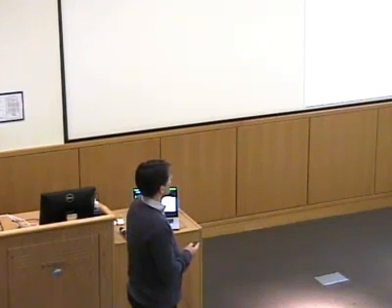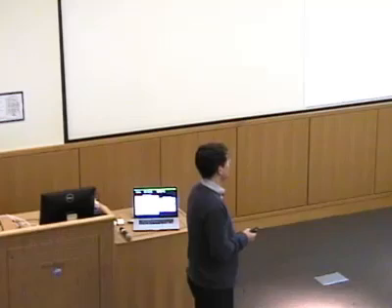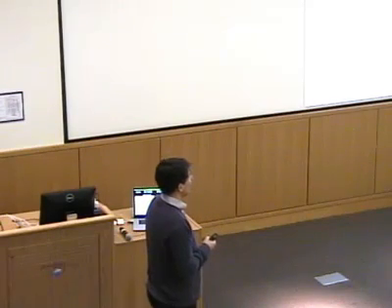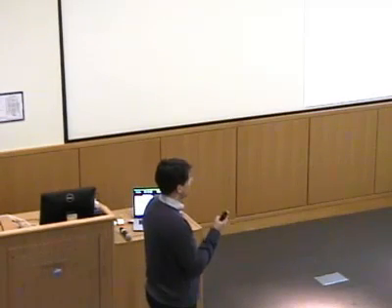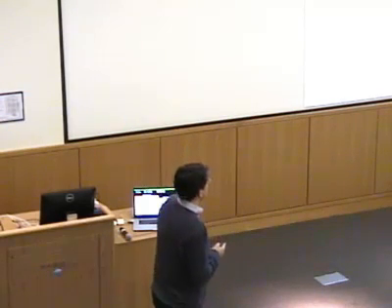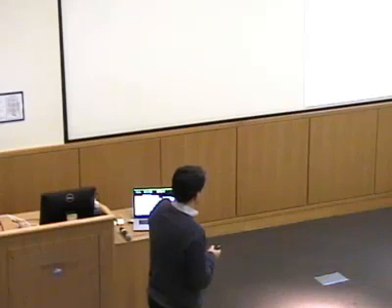That is emphasized here for this small molecule methyl dithioacetate, where you have the infrared spectrum here and the Raman spectrum on the bottom. And you see that they basically have peaks at the same positions, but they have different intensities. The reason for that is that the selection rules for Raman spectroscopy and infrared spectroscopy are different. So they have different intensity mechanisms. In fact, if your molecule has inversion symmetry, a center of inversion, IR and Raman are strictly complementary: you will have an IR band only if the vibration is antisymmetric relative to the center of inversion, whereas in Raman you will only see it if the vibration is symmetric. Now, this molecule doesn't have a center of inversion, and so you have bands that are simultaneously IR and Raman active, and so you see they nicely line up.